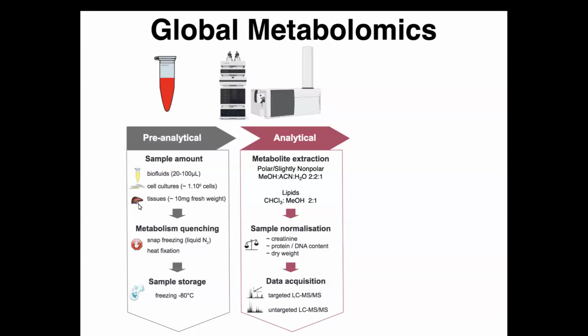For polar metabolites, LC-MS analysis is performed by HILIC in both positive and negative ion modes. The collection of both MS and MS2 data occurs at the same time.